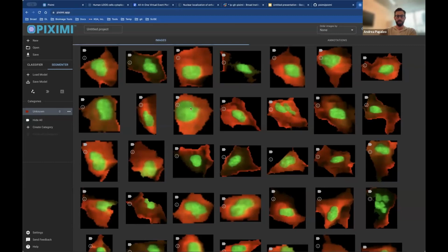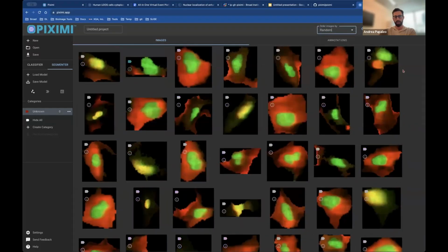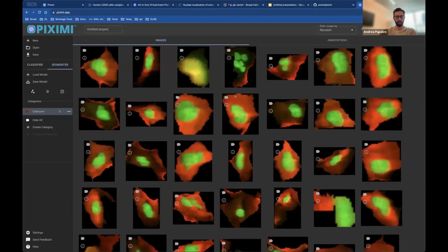This new project is loaded up here. And again, in this image viewer, or this image-based view of the experiment viewer, it shows you the category, some details about the image, number of channels, planes, what partition it's part of. And same thing here, you can organize it by category, random, what have you.